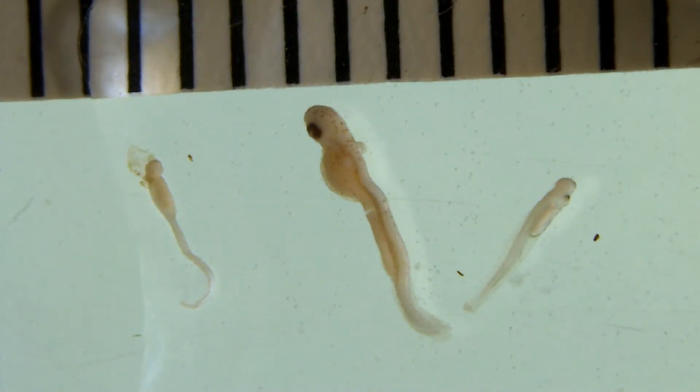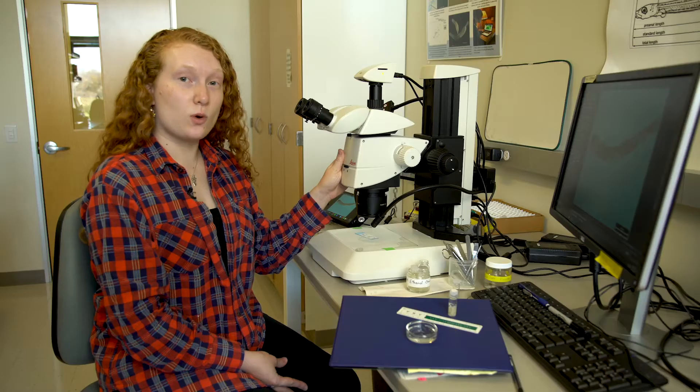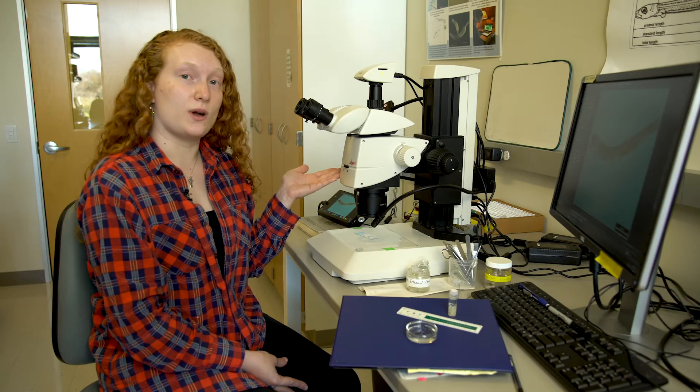So this is our Leica. It's a stereo microscope. It just has much better power to it and higher image quality so that you can see all the details of the fish that you need to see to identify them.